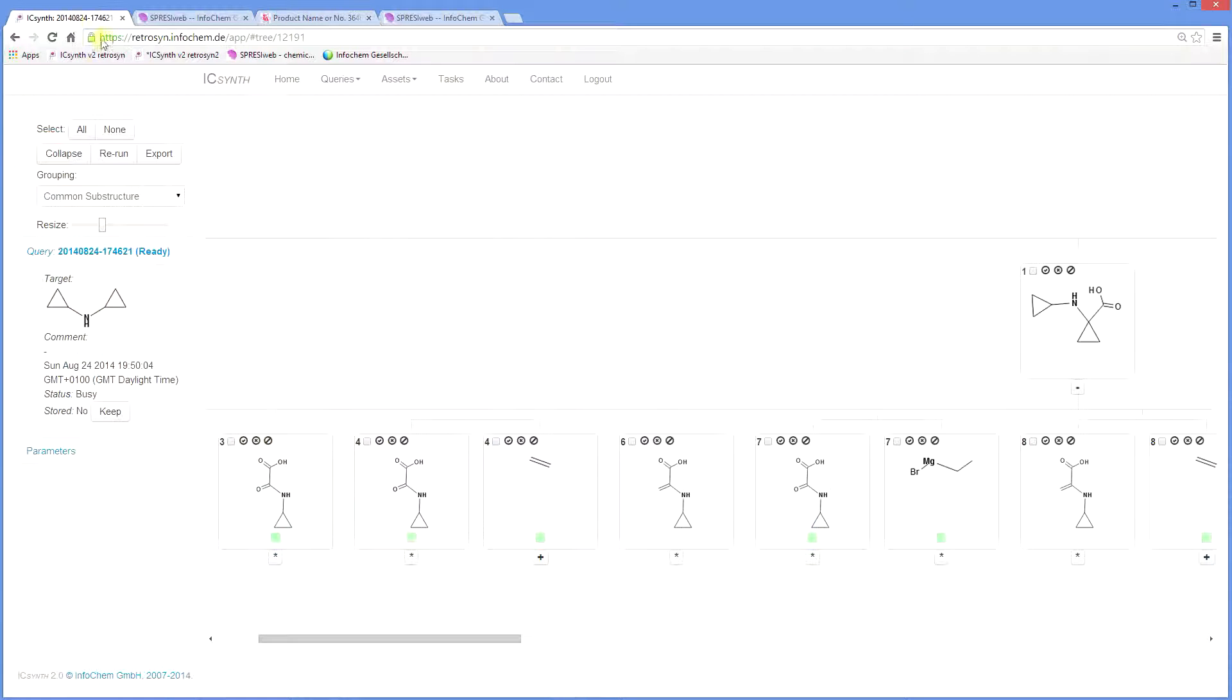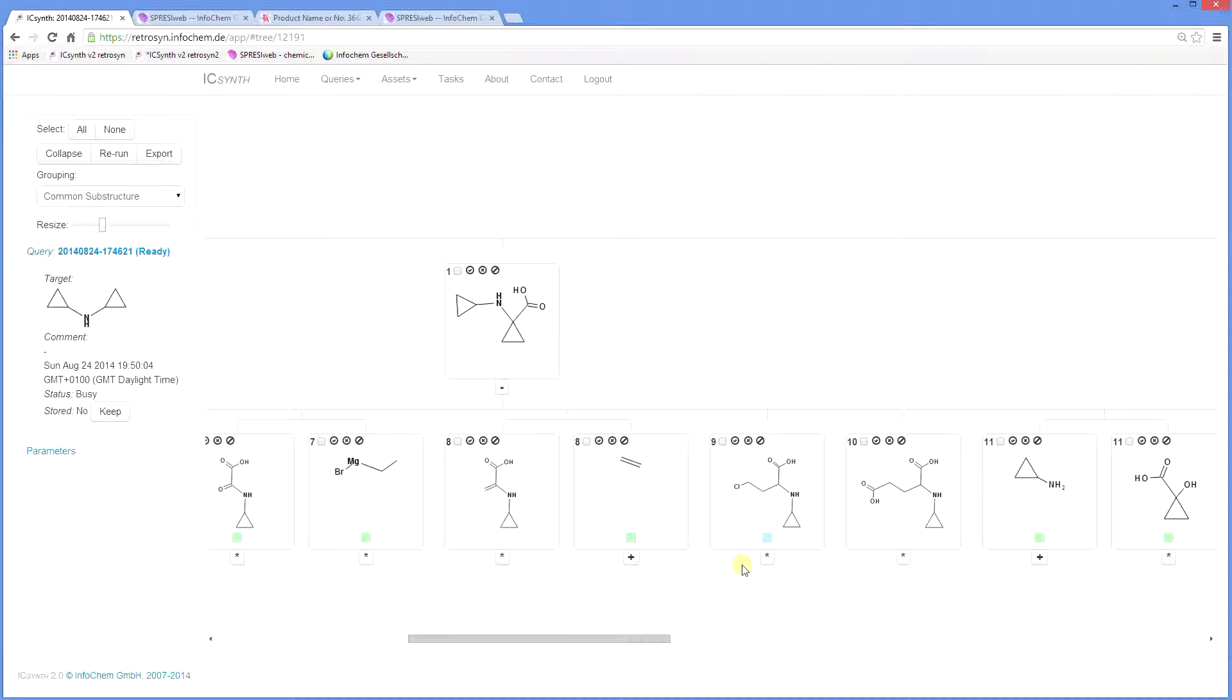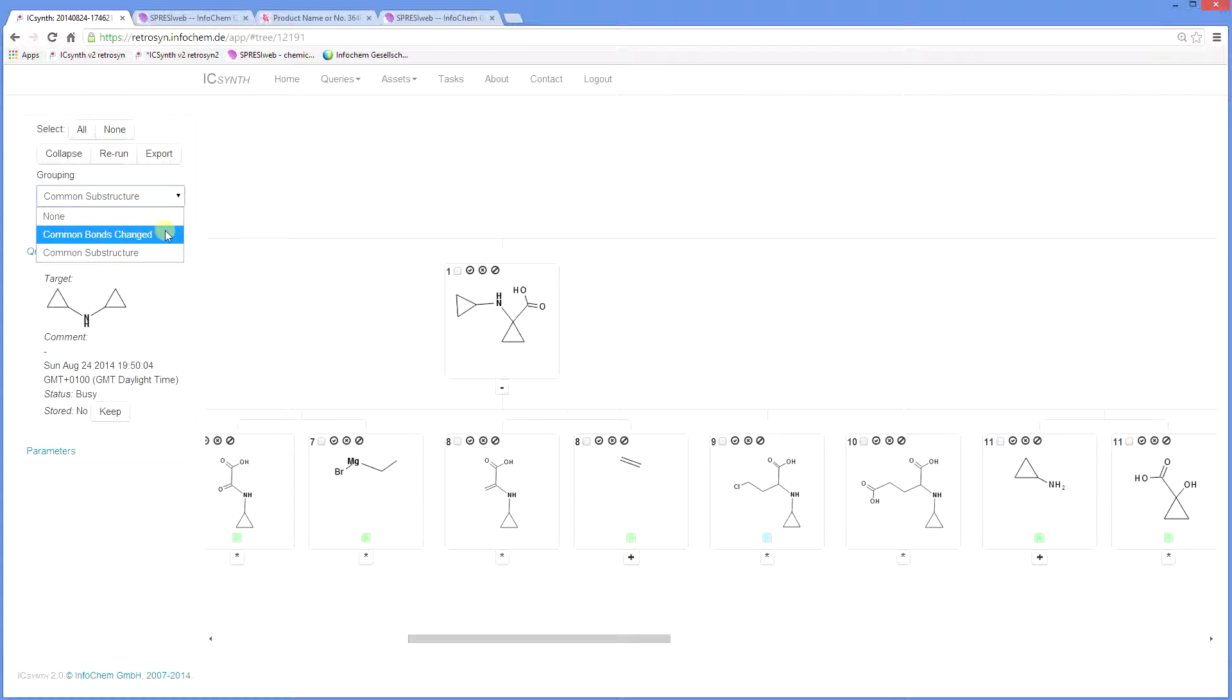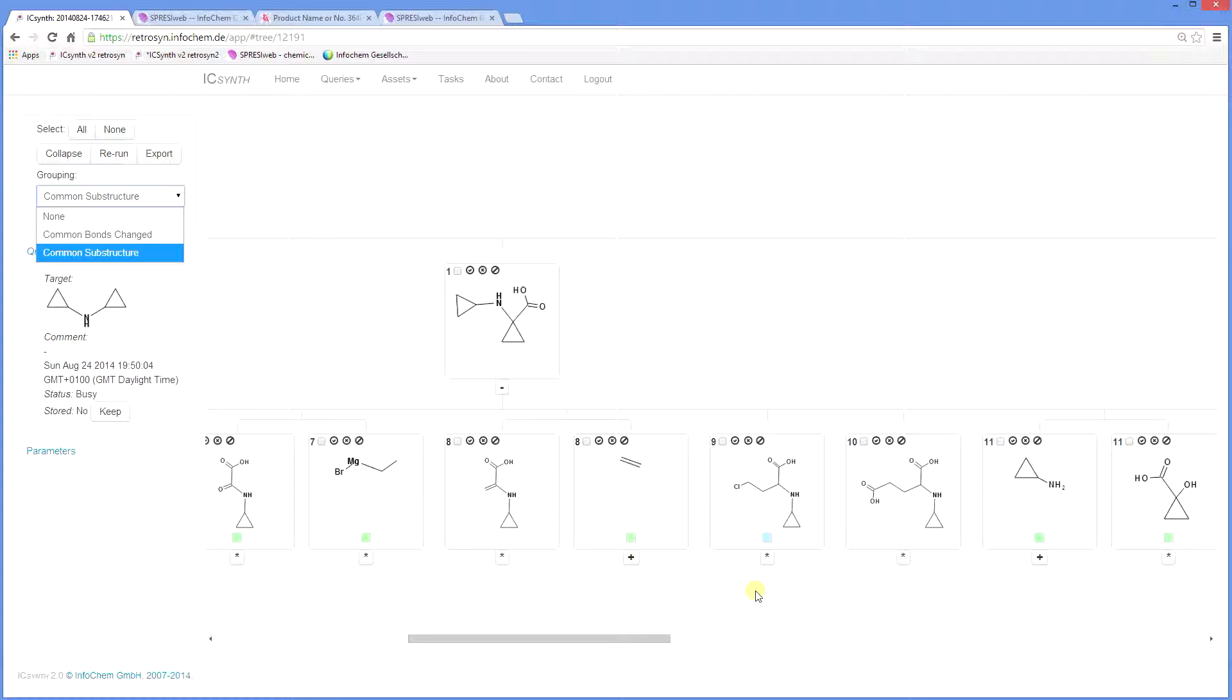Going back to the tree, we see that some nodes have a blue square. This indicates grouping. The purpose is to represent a group of similar structures using one structure, thereby reducing crowding on the tree. In this case, the structures are grouped by similar substructure. Grouping can also be based on common bonds changed. Indeed, no grouping is also an option, but this may increase the size of the tree.